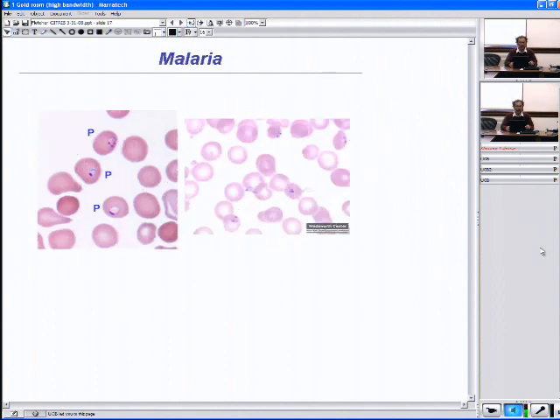One that's particularly relevant to developing countries is detection of malaria, and this is perhaps one of the most relevant cases where optical microscopy is still the gold standard for evaluating if someone has malaria or not. There are a number of other technologies that are being developed, but they continue to be compared to microscopy in evaluating them.